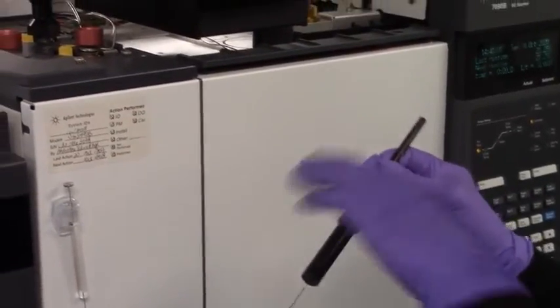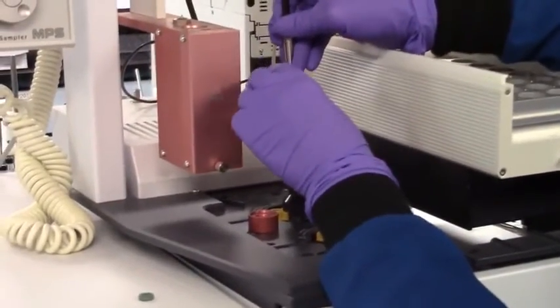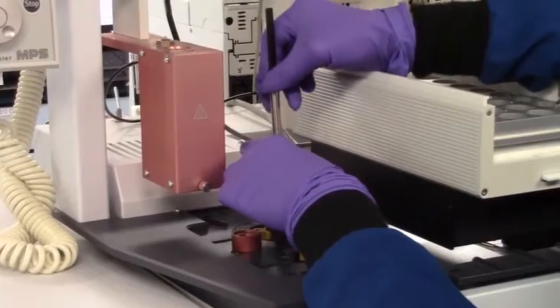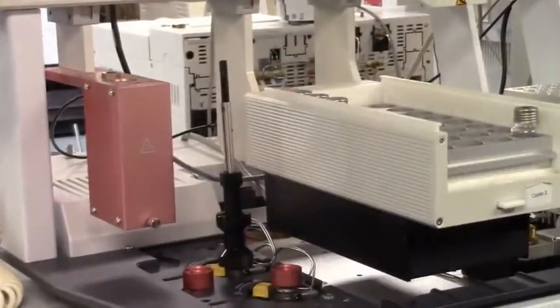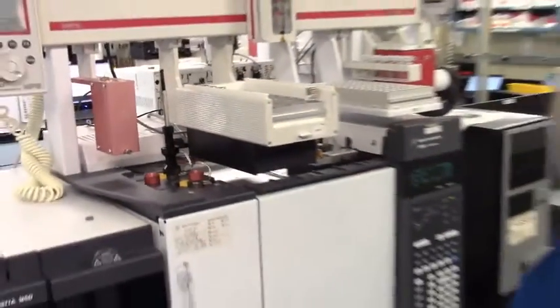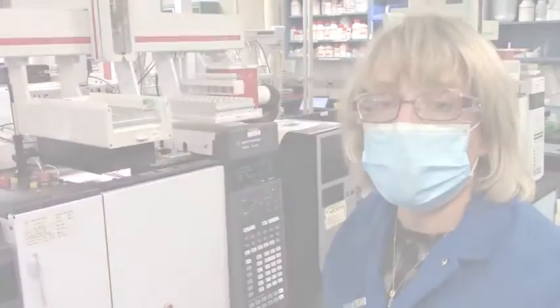So next step is to inject it just like a needle into my inlet, and then I'm going to push the plunger down and expose that fiber. So I'm injecting it here into my inlet, push down on the plunger. Now it's inside the inlet, and I hit start. So now my analysis is going to proceed just like it would with a regular syringe injection.